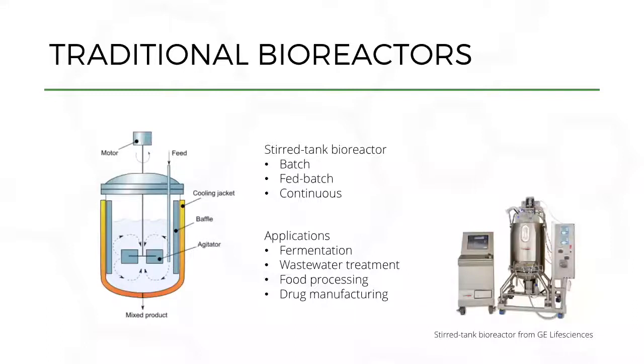Most of the applications with traditional bioreactors are focused on fermentation, wastewater treatment, food processing, and also drug and protein manufacturing. You can see here an example from GE Life Science, their small stirred tank bioreactor. The classic ones are stainless steel, and obviously you have all these tubings and a computer to operate and automate the system.